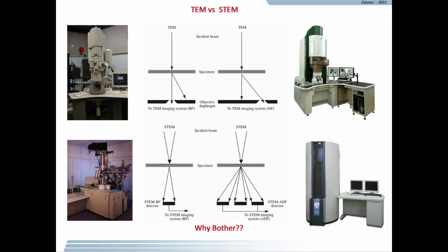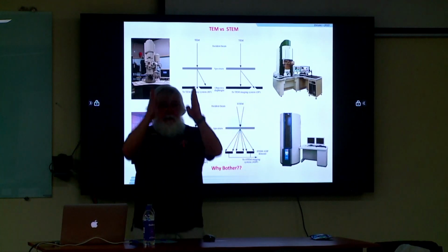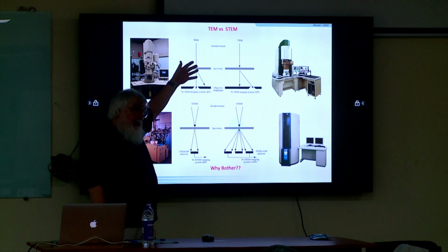All right. We've mainly been talking about TEM imaging so far. So we've had a straight through parallel beam hitting the sample and looked at electrons that were scattered off and formed images. We formed amplitude contrast images, diffraction contrast images, or phase contrast images. There is another operating mode in the instrument called scanning transmission microscopy. The difference, and we talked about this before, is instead of having a nice parallel beam, we have a focused beam.